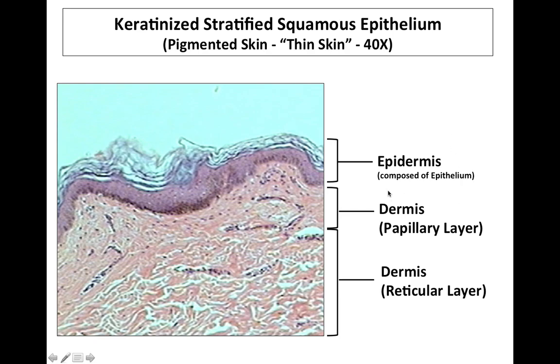So the skin itself is divided into three primary layers. The hypodermis, not shown, is composed primarily of adipose tissue. The dermis, the next deepest layer, is actually divided into two regions, the bottom reticular layer here, and then running at about this level here, starting here and running up and curving around, that begins the papillary layer of the dermis right here. These are both connective tissue. The epidermis itself is where we find our epithelium.